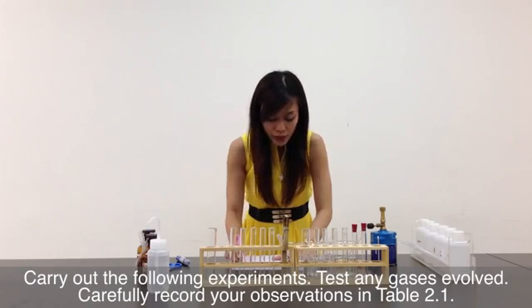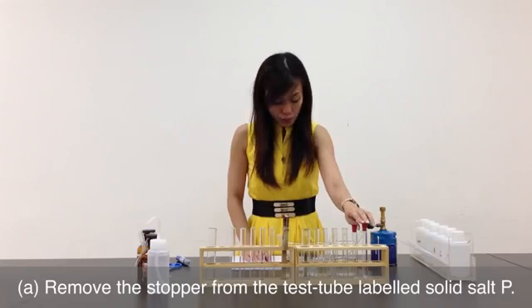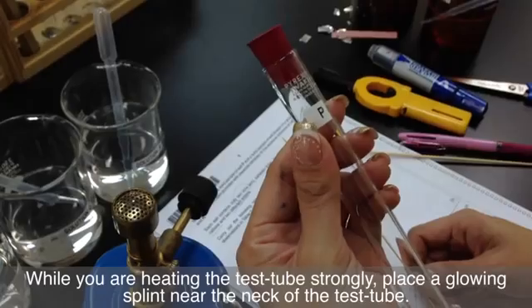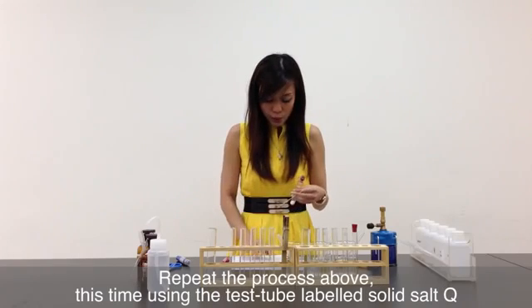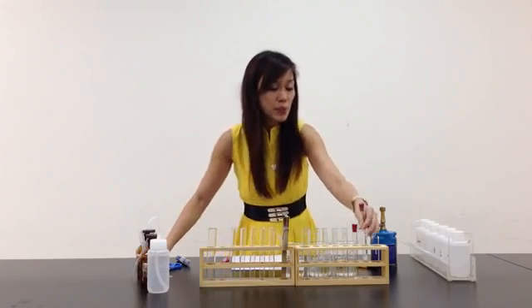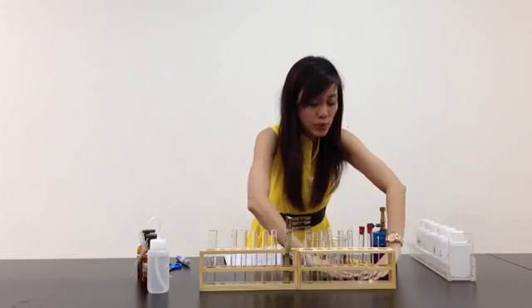Test any gases evolved and carefully record your observations in table 2.1. Part A: remove the stopper from test tube A labelled as salt P. Heat this test tube gently and then more strongly until no further changes are seen. While heating strongly, place a glowing splint near the neck of the test tube, ensuring the splint does not fall in. Repeat this process using test tube labelled solid salt Q. I have to heat P and Q, so let me move these aside and put my splint in front.